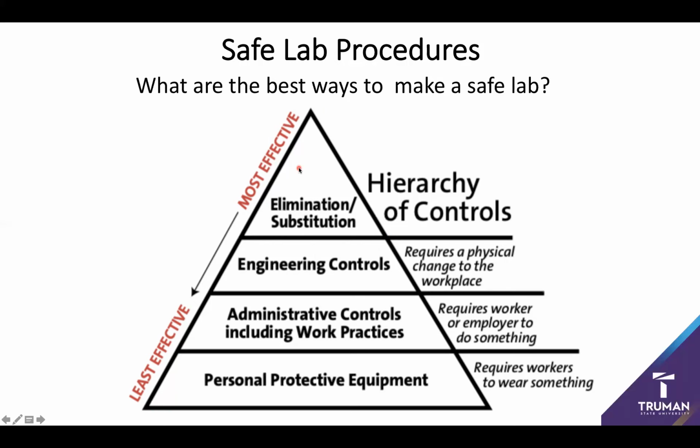However, sometimes you just have to work with hazardous chemicals because they're the only ones that make the chemistry work.